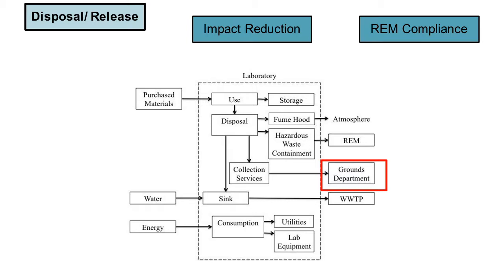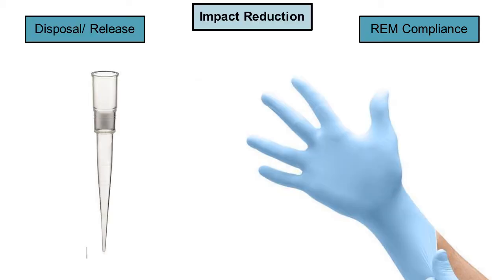Next, I'll talk a little bit about disposing of something through the trash or recycling it, but from the perspective of solvents. It's a mess to determine whether or not solvents within a plastic have contaminated it to become hazardous. And the EPA, I've included a link to this at the end of the presentation, so if you're really concerned about it, you can definitely look it up, but I'm guessing you probably know. But if it becomes a toxic waste, an acute hazardous waste, ignitable, corrosive, reactive, or a toxicity characteristic waste, that's when you've got to be concerned when you're using it, and it could probably contaminate the plastic and be considered hazardous.